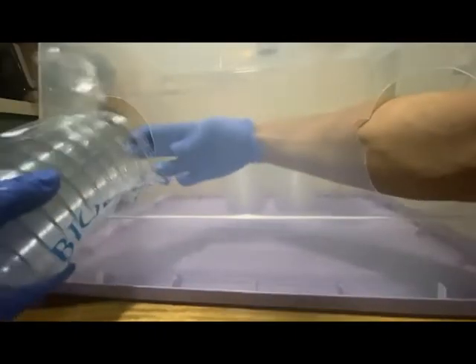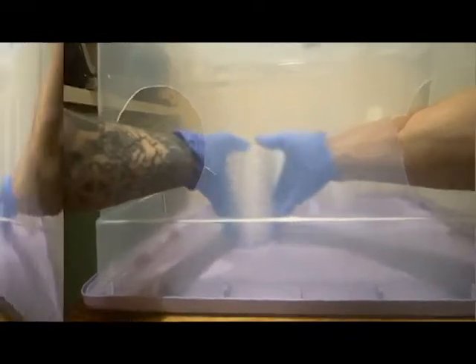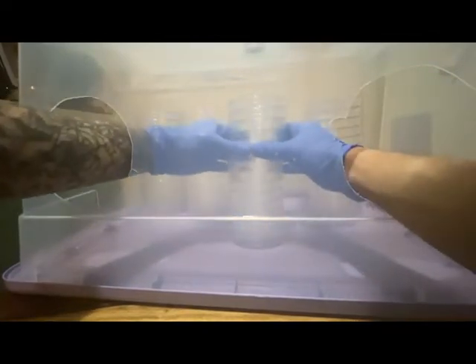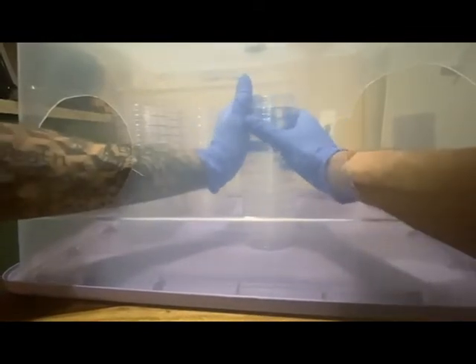Whoa, that was almost very bad. So I like to have stacks of 15. I didn't always start out with stacks of 15. I used to start out with just stacks of 10. For those who haven't poured before, this is the quickest and most efficient way of doing things. This is also the safest in terms of risk of contamination.